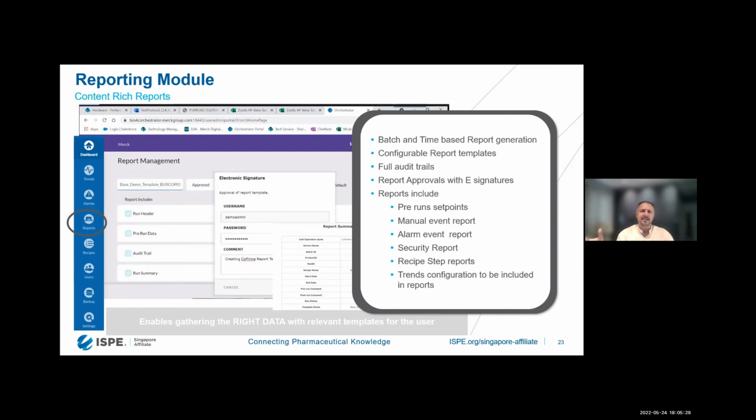If you have, say, 10 systems, and going back to the earlier poll question, if you have these 10 systems from 10 different companies, then each and every equipment manufacturer has their own reporting template, right? I mean, they have their own way to report. So it becomes very difficult. Say, for example, if you have a Chrome system from 3 different vendors, each of them would have 3 different formats for the report to be generated. So the difficulty is to match that.